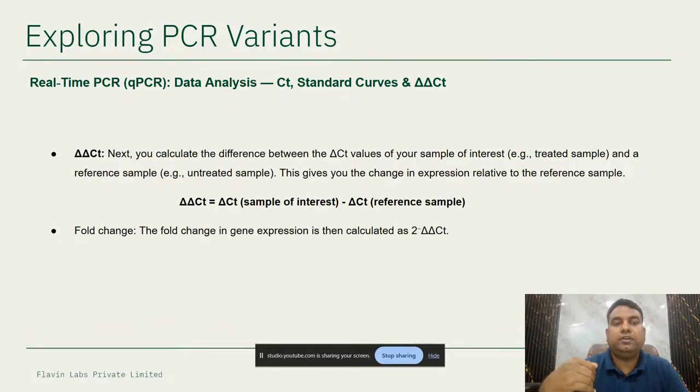Fold change will give you the value of the expression level, whatever the change in the gene compared to control, how fold it is higher or how fold it is lower than your control sample. That will define whether the gene is upregulated or downregulated.